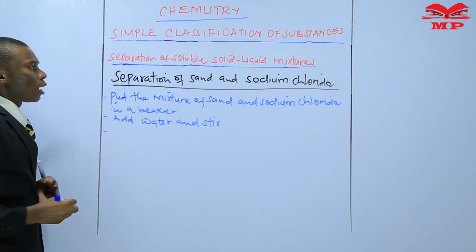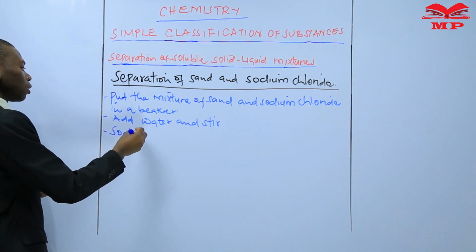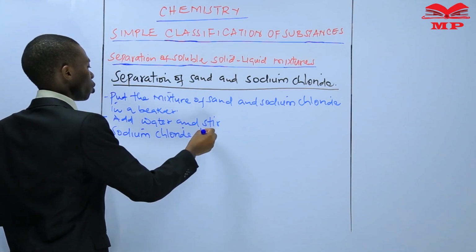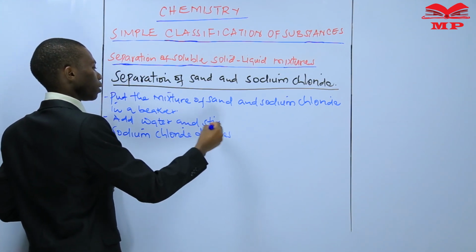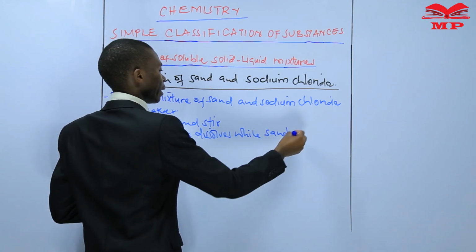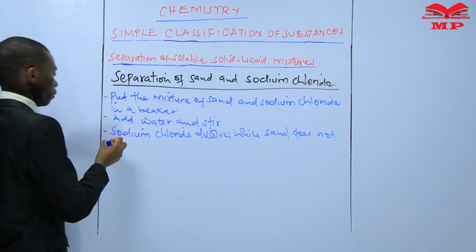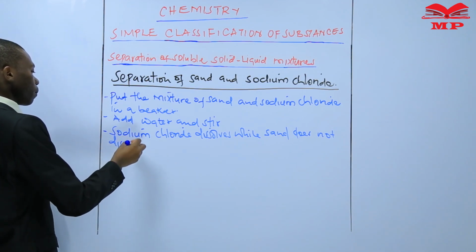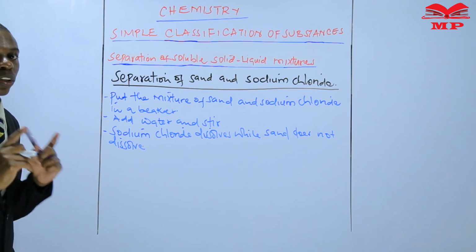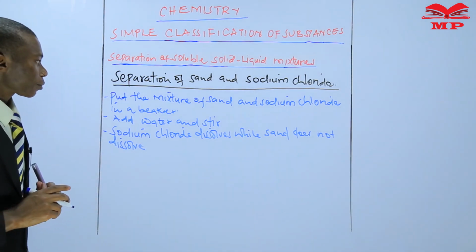Then, when you stir, sodium chloride dissolves, while sand does not dissolve. Sodium chloride dissolves in water while sand does not.